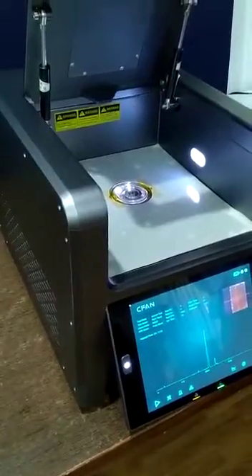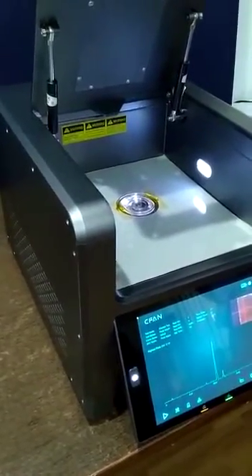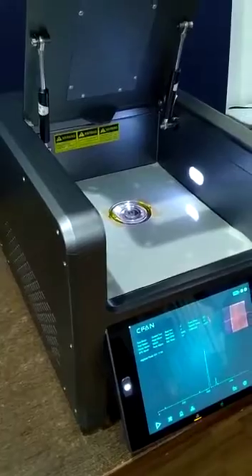After peak adjustment, machine is ready for testing. It will take 40 seconds of sample scanning.